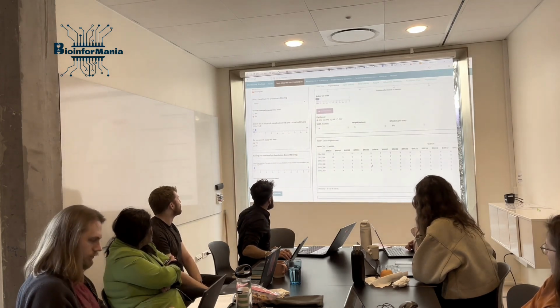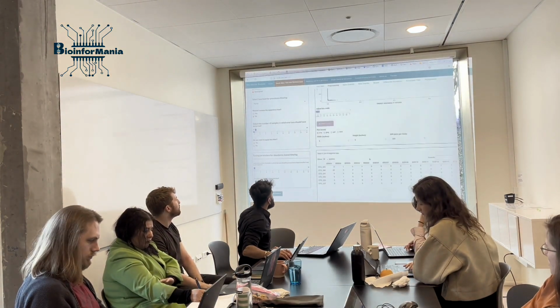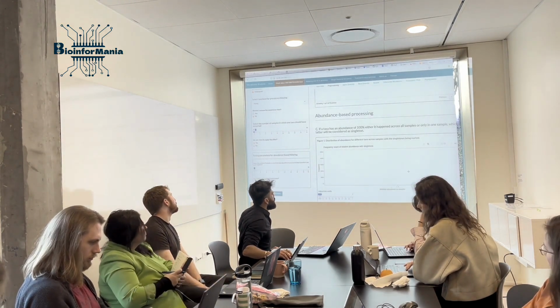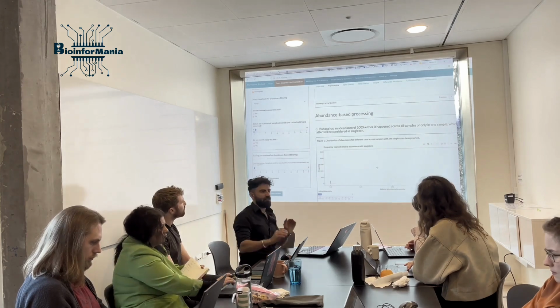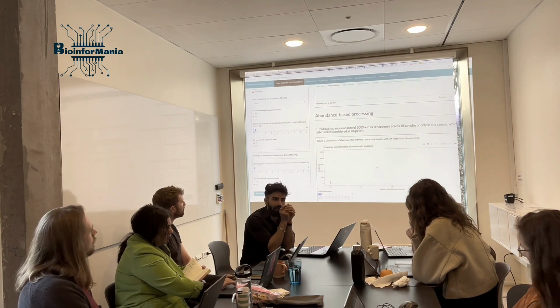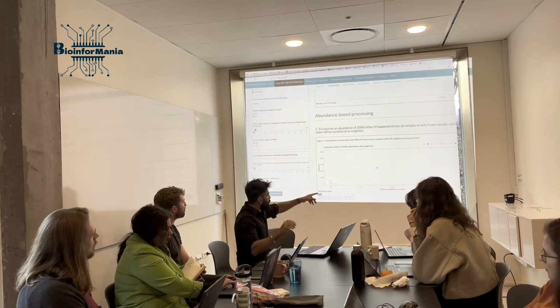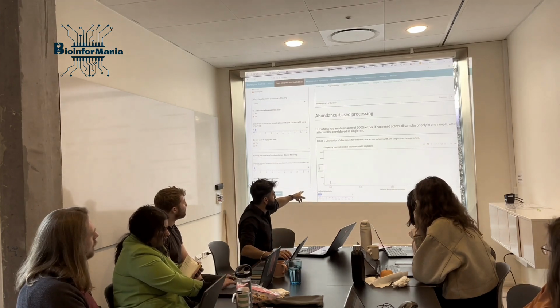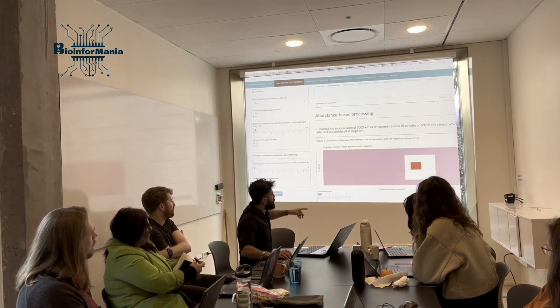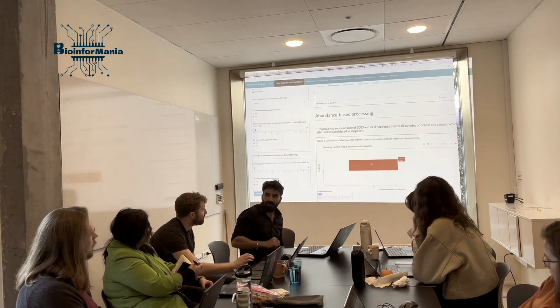Down here is about singletons, and this is the abundance-based singleton finder. Where is that file? Yeah, if you go here, we say we have 2 situations. If a taxa proportionally happens 100% of the time across all samples, this will give us a relative abundance of 1, okay? Just keep zooming. You can find this one here. So you have 6 of them, which have a relative abundance of 1.